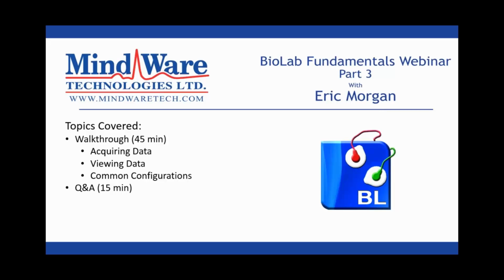We're going to start with a walkthrough, where we're going to talk today about acquiring data in BioLab, what the acquisition screen looks like, and some of the different features that are available on it. We're going to talk about using BioLab as a data viewer to open files, modify them post-acquisition, and look at your data. And then finally, we're going to cover some common configurations from start to finish, starting with BioLab as a clean slate and working through to acquiring data.